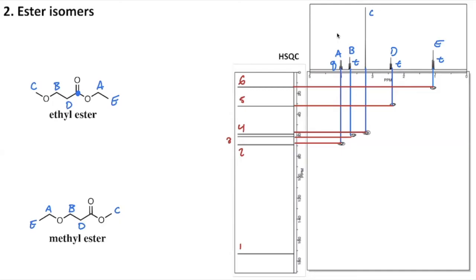So if we start over here where we began, near carbon E. If we follow down, there's a peak beneath that. So that looks to me to be an E to carbon 6 correlation. What that's telling us, and we'll fill all this in more later, is that our E protons are here, that carbon is carbon number 6. So we'll do a nice and not so sloppy jumbled job of labeling those again in a moment.